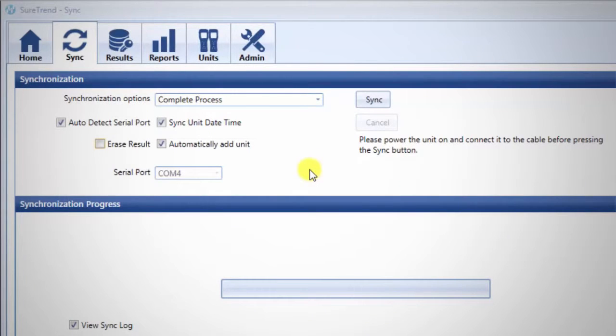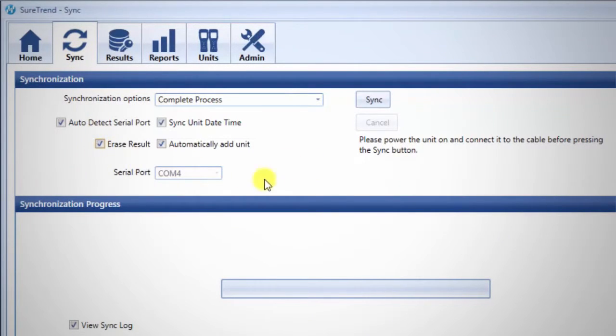Navigate to the Sync tab. Check Erase results if you wish, and then click the Sync button.